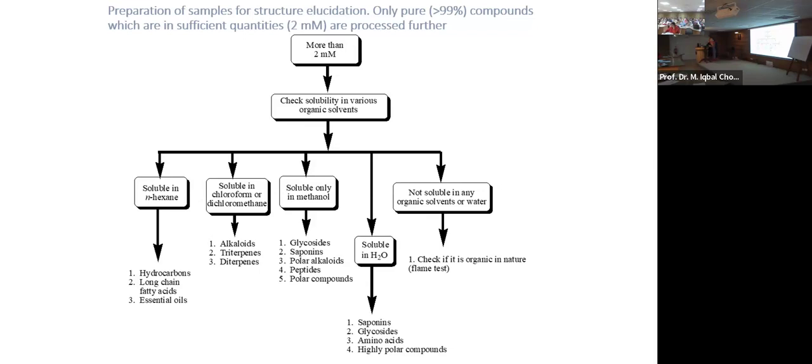So if you use a non-deuterated solvent that has hydrogen, for example CHCl3 instead of CDCl3, which peak will you observe? Only the CH, because it has the proton, and it is a huge peak, and you will not be able to see your own sample signals by comparison.